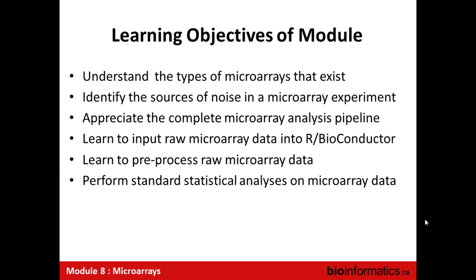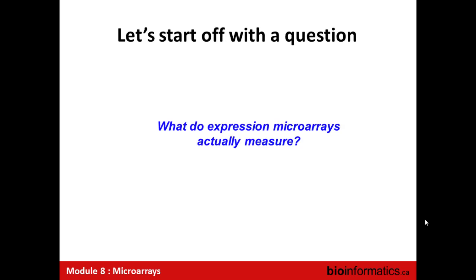And then in the practical side, we'll start working on how you can input the raw data into Bioconductor, how you can pre-process it, and maybe how you can get into the standard statistical analyses. That last question, some people will get to, some people won't, depending on how far people get during the study area. But we give full answers so you can see template code that goes through those types of analyses.